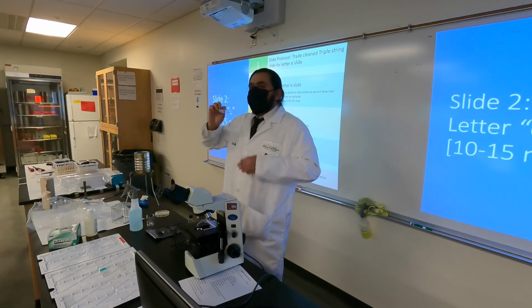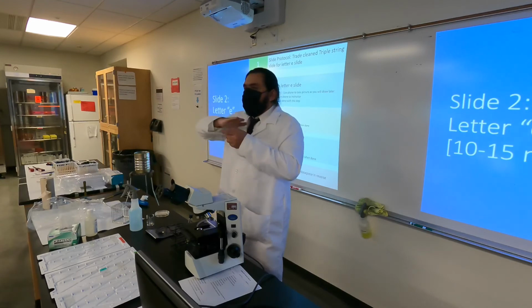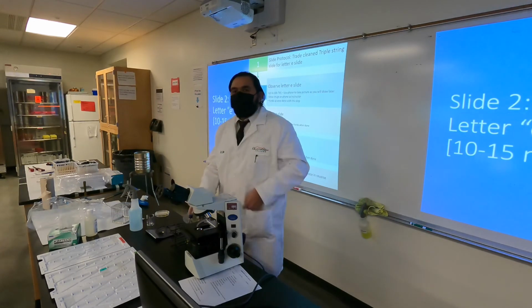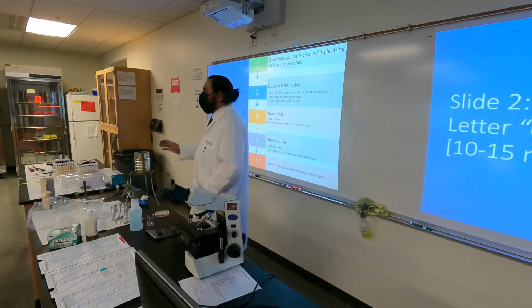That's it. So you're gonna want to rock it back and forth, and a little bit of side to side. That will even out the liquid. And then that's where the plate stays. You will not touch it any further, okay? So transfer, pour, let it be.